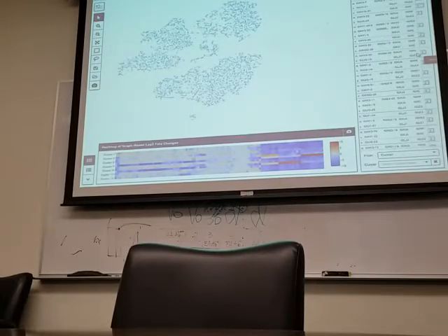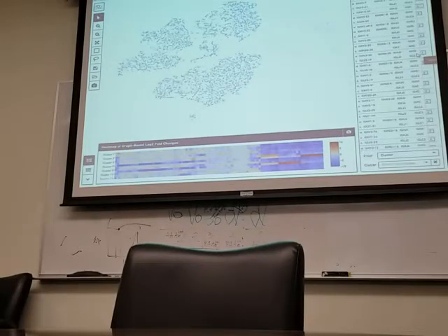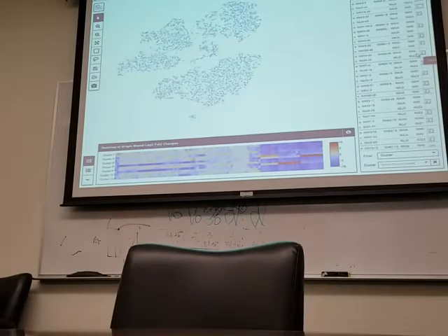I wonder if there's a way to relax things stage-wise. What I'm trying to think about is going back to whatever the germline gene was. If you relax D, you might get that, because you relax to the point where all the ones that selected that D, and then you relax J to a point, and then I guess V you can call pretty clearly, right?